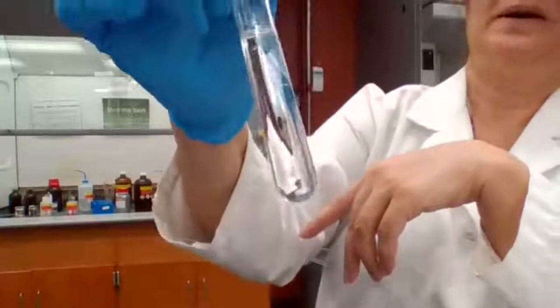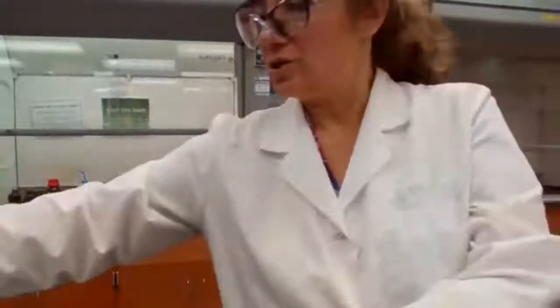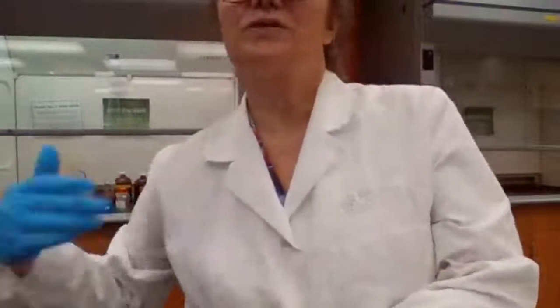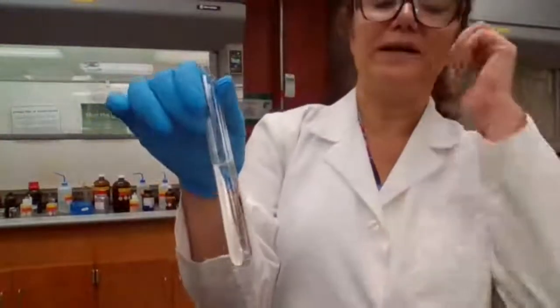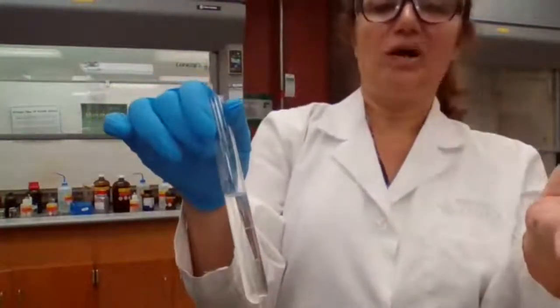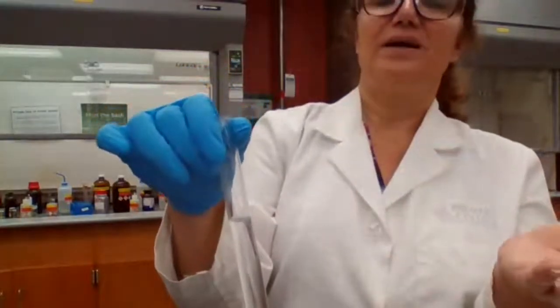So the compound, if it's carboxylic acid, it dissolves in sodium hydroxide, which was a fast reaction. With sodium bicarbonate, this was the benzoic acid with sodium bicarbonate. If you look at the video again, it didn't dissolve completely, but it was forming bubbles, and I recorded it as dissolved.